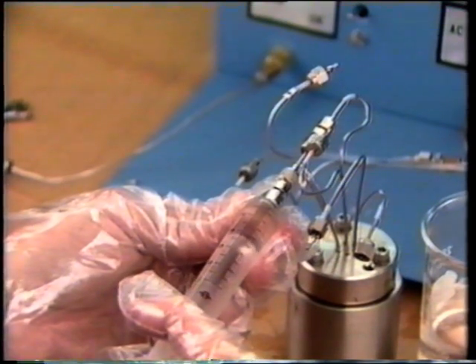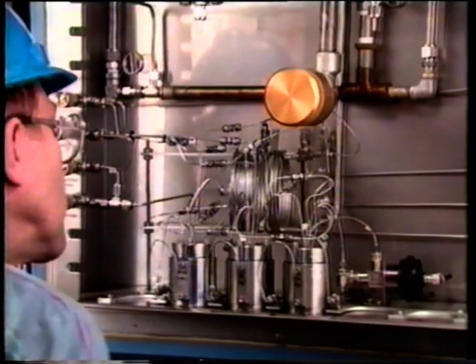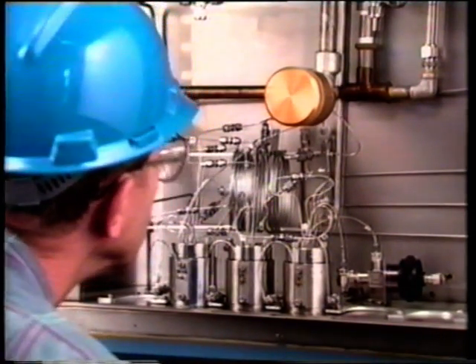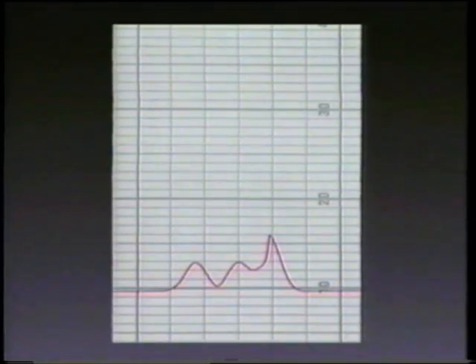Reconnect the valve and verify proper operation. If you suspect valve maintenance problems, there are some troubleshooting procedures that can be done while the valve is in the analyzer. The chromatogram indicates valve leakage may be occurring.